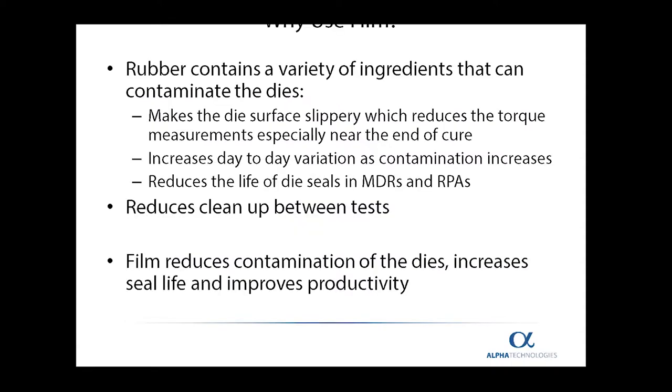The first question everyone always asks is, why do I have to use film? Rubber contains a variety of ingredients and chemicals that can contaminate the dies. This contamination often makes the die slippery and reduces the torque signal measured by the rheometer. If you continue to run tests without film, the day-to-day variation will increase because the contamination will increase.